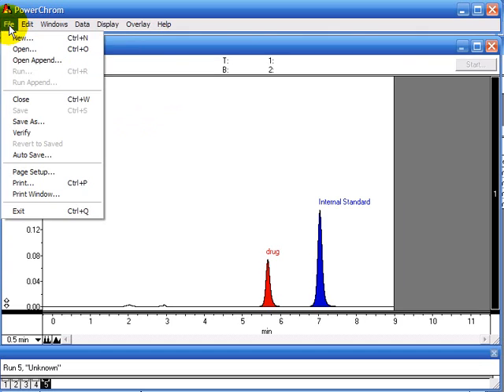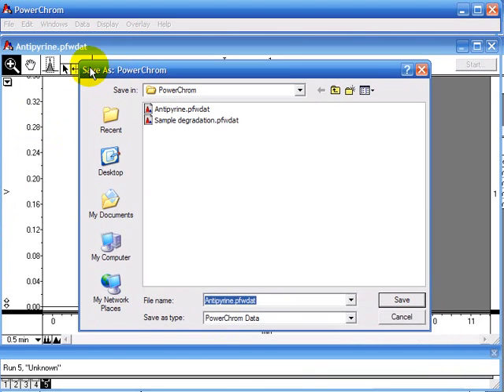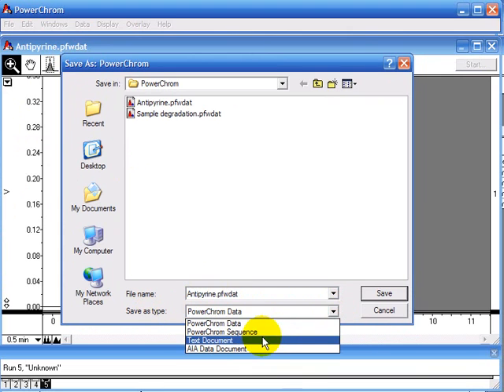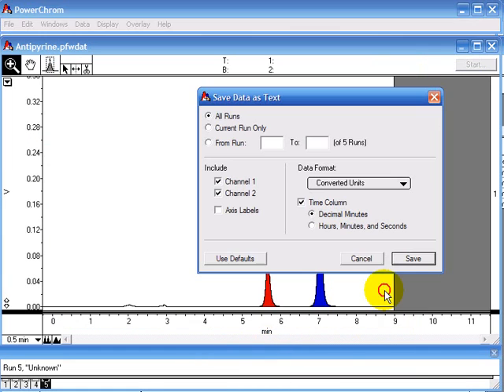Click on File, Save As. In this dialog box the Save As type should be text document. Click on Save.